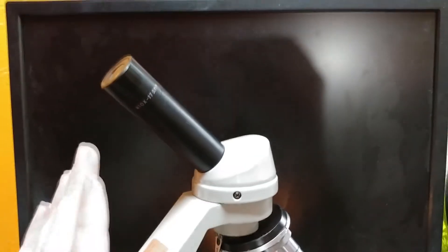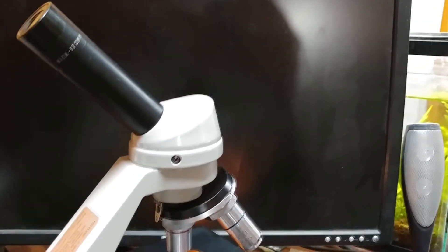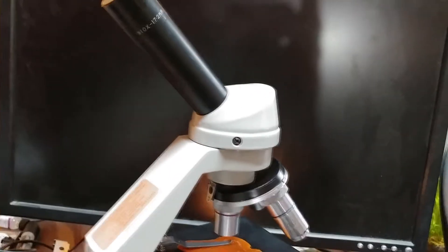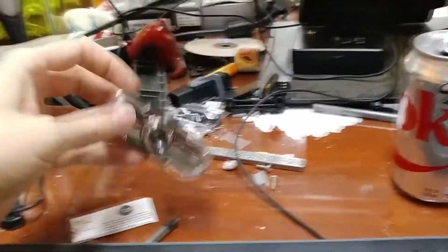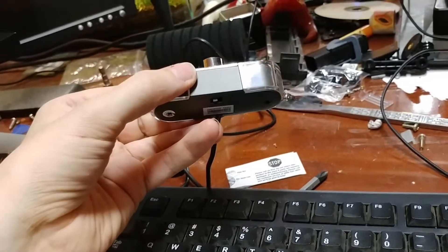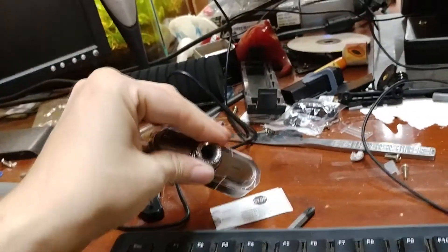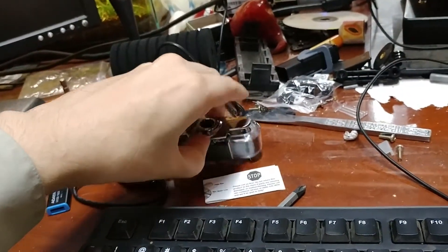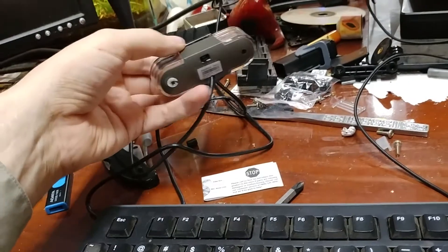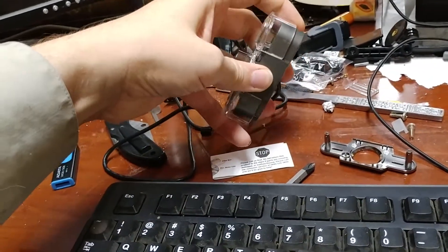How can you easily put a cheap webcam onto one of these and make the equivalent of a $450 microscope out of this? I've got here one of these cheap eBay pop-a-look cameras. I got this one on Amazon — I think I paid $17, but usually they're about $21. These things, a couple screws in the back, you just pull them apart.